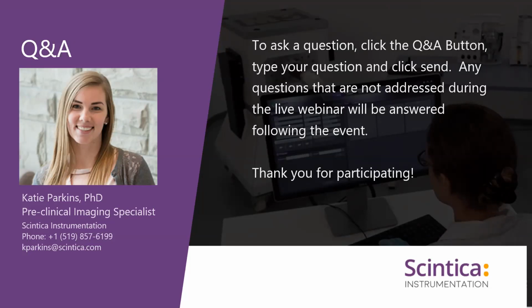Yeah, so that's a great question. I would say the mouse model definitely needs to be considered, especially for optical, because again, you're relying on the light getting out of that tissue. And so the fur can definitely have an effect. And you may have noticed in the images, especially if you're using a mouse with black fur, we will shave or Nair the area of interest just to get as much light out as we can.